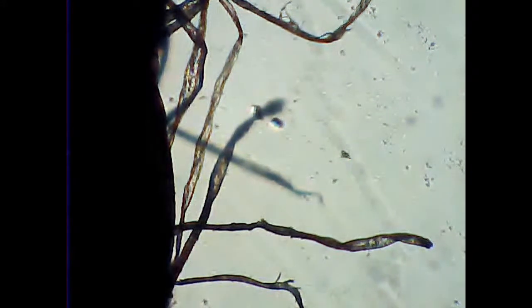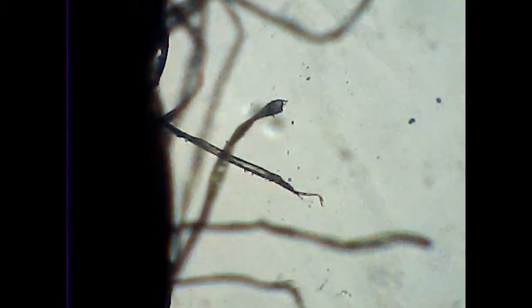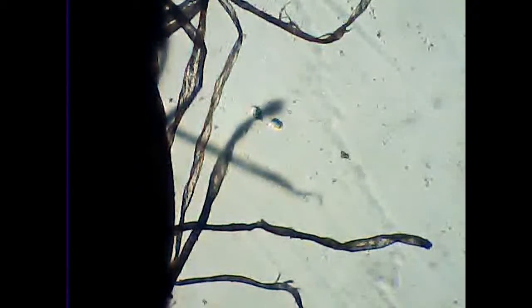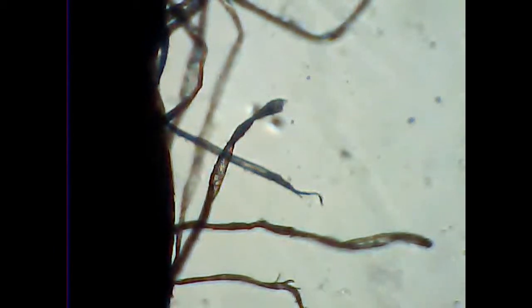So let's look at the same phenomenon using our textile thread. So you see, while changing the focus, different layers get into focus. Now there are different threads. There is indeed only one at the moment thread being in focus, and now it's the deeper layer getting into focus again, and back again, and back again.